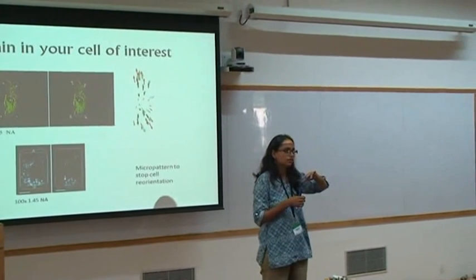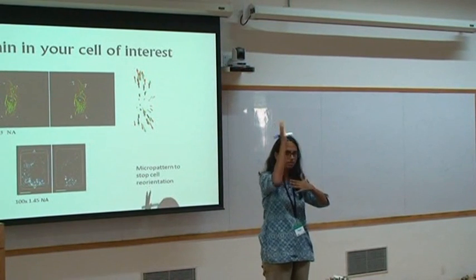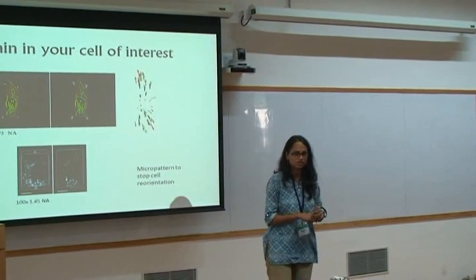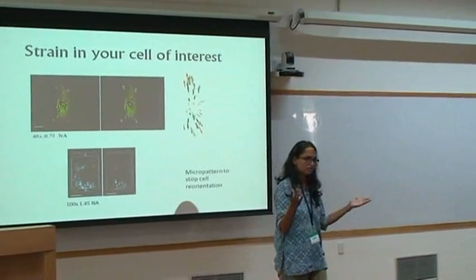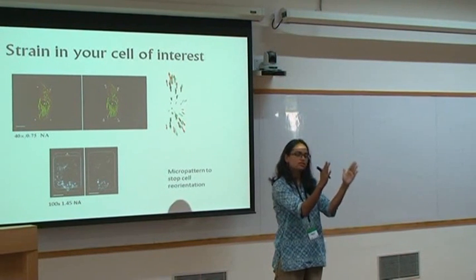They will start to remove their focal adhesions, form new ones, and reorient. They can become completely perpendicular to the direction of stretch. It depends on how you do it. They can be parallel to the direction of stretch, and so on. So what we do is we do not allow that. We do not give excess area for adhesion, so there is no scope of rotation. So you have a rectangular patch, and that's it.